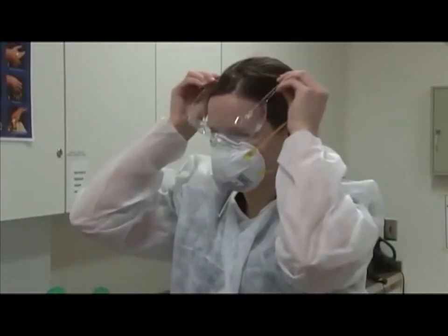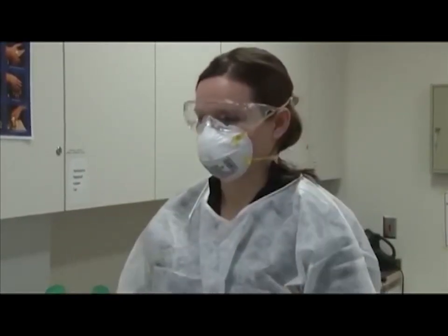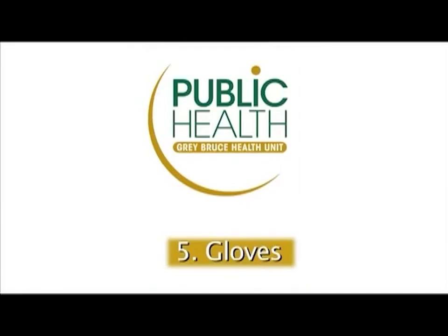Position eyewear over your eyes and secure to your head using the earpieces. If you wear eyeglasses, put them on first, then don your eye protection. If required, the face shield should fit over the brow.